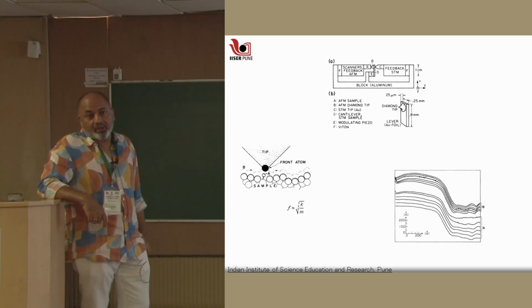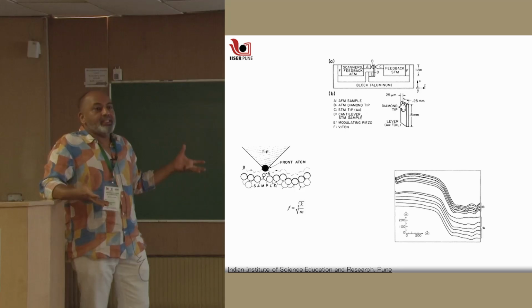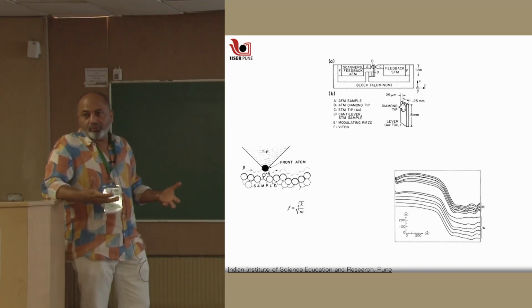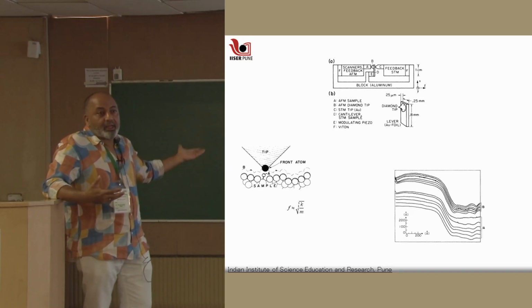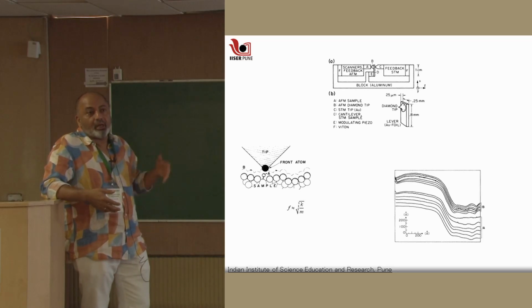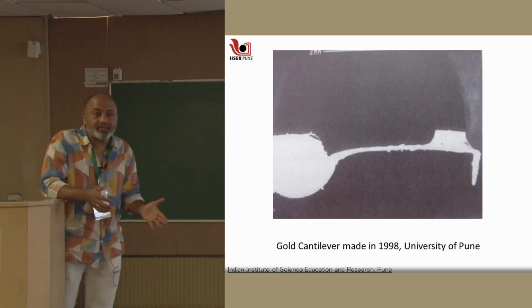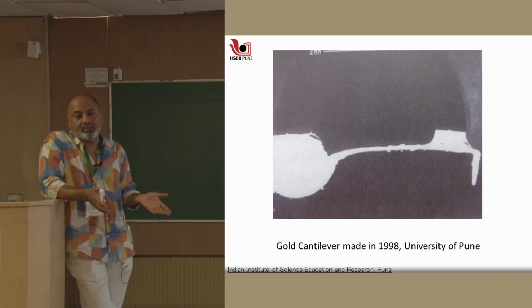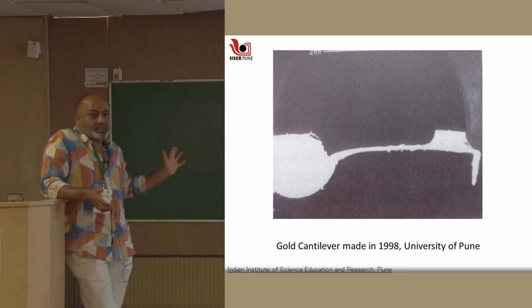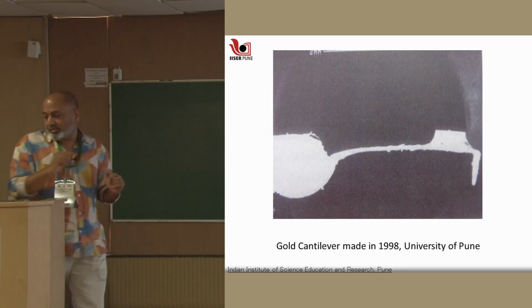I can image oxides, we can image anything, and no one thought of biology back then, because these are all very, very rigid things. You want the Young's modulus of both the substrate and the cantilever material, whatever, to be in gigapascals and more. But for AFM in life sciences, we are dealing with materials which have extremely low Young's modulus, of the order of kilopascals even. Okay, 6 orders of magnitude smaller. So this is still restricted to non-conducting samples, but with high Young's modulus.